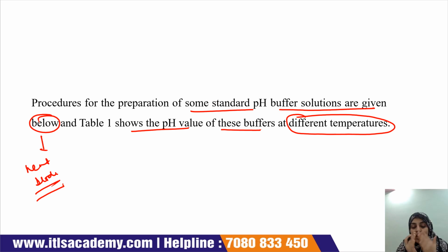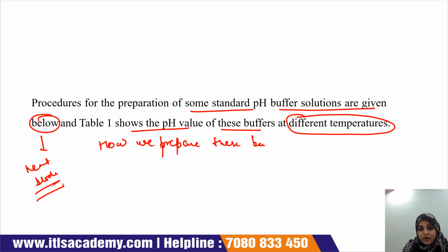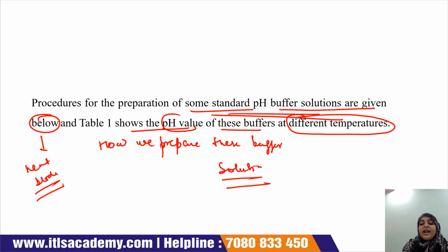So first of all we are going to discuss how we prepare these buffer solutions. After that we are going to discuss the table which shows the pH values of these buffers at different temperatures.